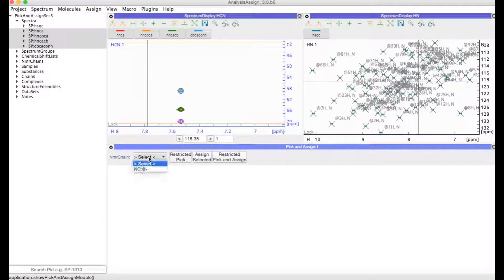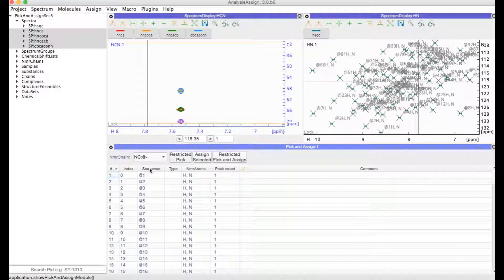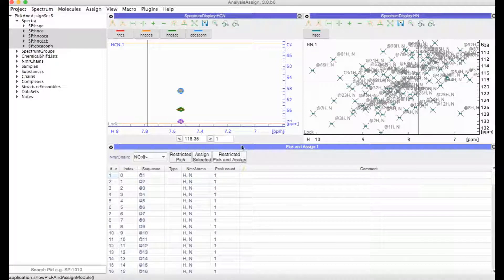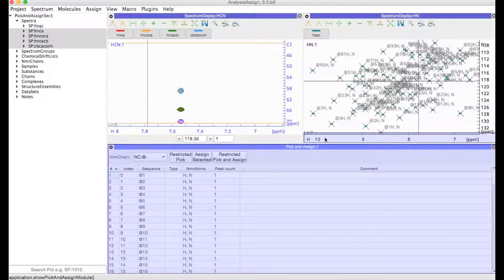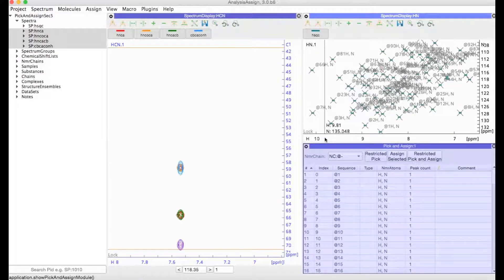Now I select the NMR chain in which I have all my NMR residues, and I'm going to place this module just here underneath my HSQC.